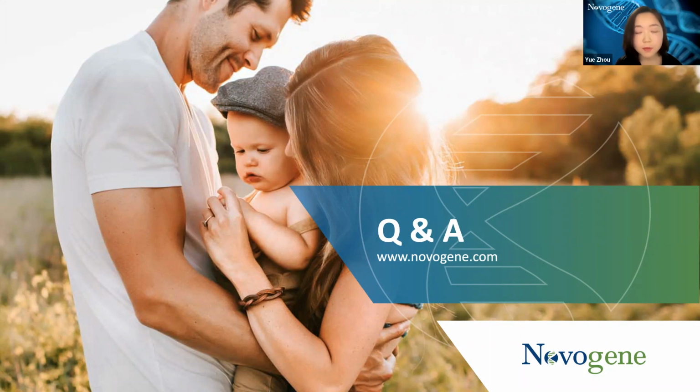The first one is if you do not have a reference genome ready, you can first perform a genome assembly using, let's say, the DNA approach, and then the RNA-seq after that would be just the standard one, and you can definitely use NovoMagic on it. But if you do not want to use the DNA approach, but only the RNA approach, then this will be a de novo transcriptome analysis project. And for this it is so far not applicable to NovoMagic, but we can definitely perform the analysis from the bioinformatician in our team.